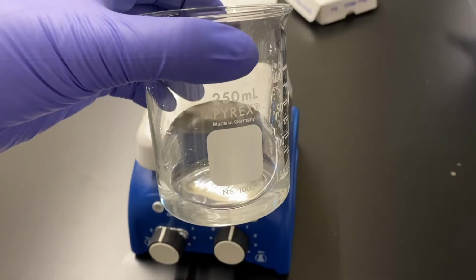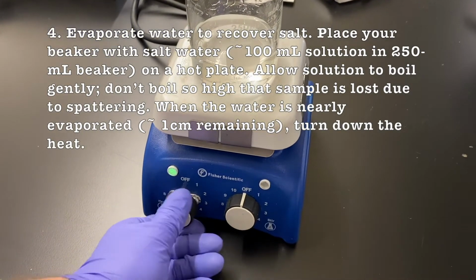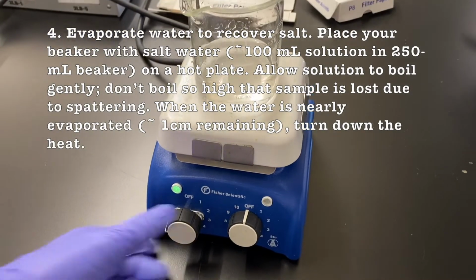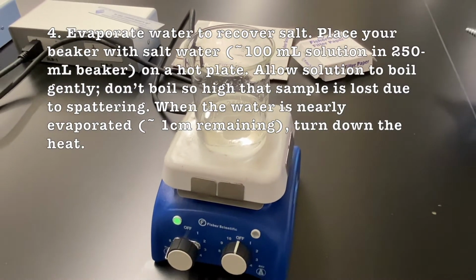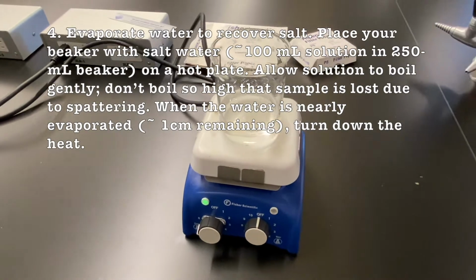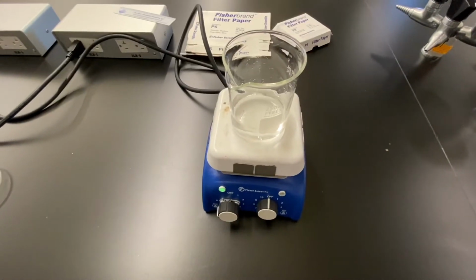So now we're going to evaporate all of the water that is in the beaker, leaving just the salt. Once the water is gone, we can take the mass of just the salt and the beaker. We already know the mass of the beaker without salt. You subtract those two and you get the mass of the salt.